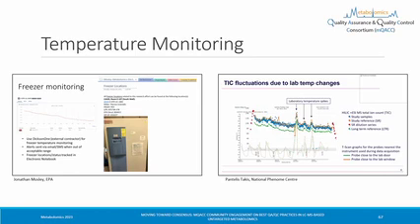For temperature monitoring, right, freezer monitors are very, very common. So this is an example that Jonathan sent from his work at the EPA. Pantelis Takis from my former group at the National Phenome Center sent this through, where they actually monitor room temperature and then store that data alongside the analytical data and use it to understand the analytical data. So actual integration of external temperature monitoring.